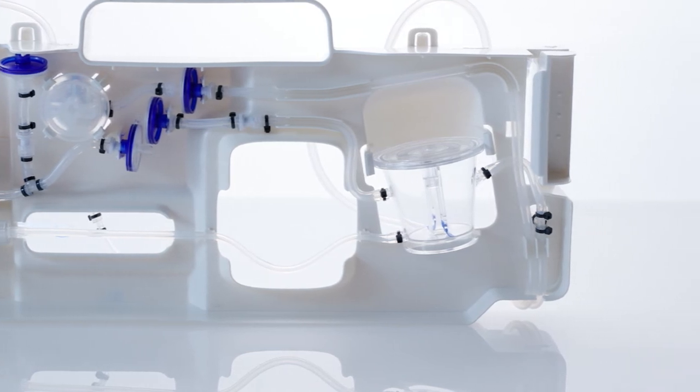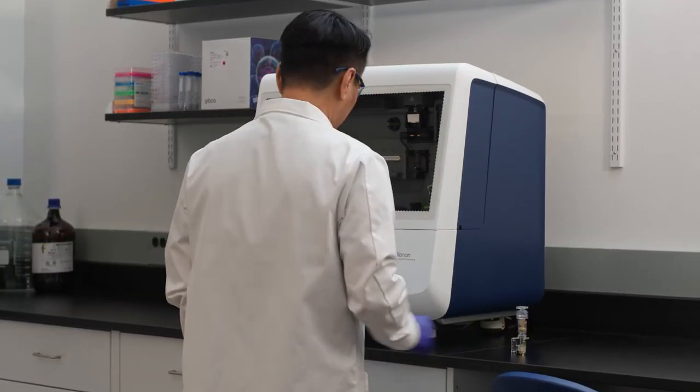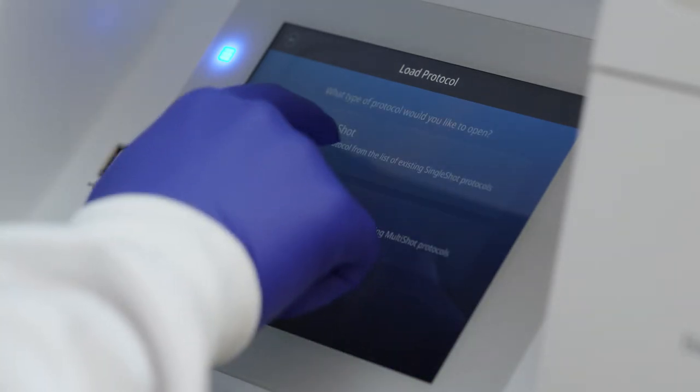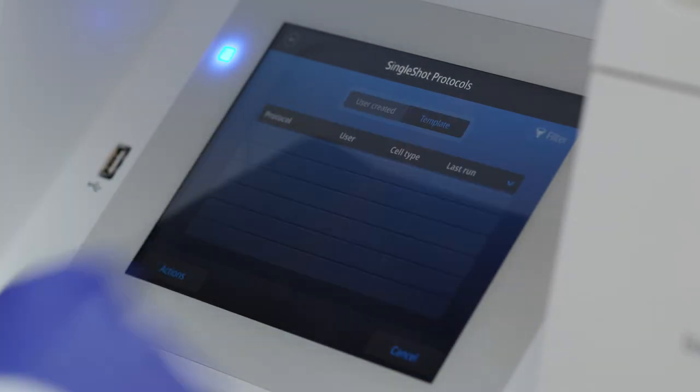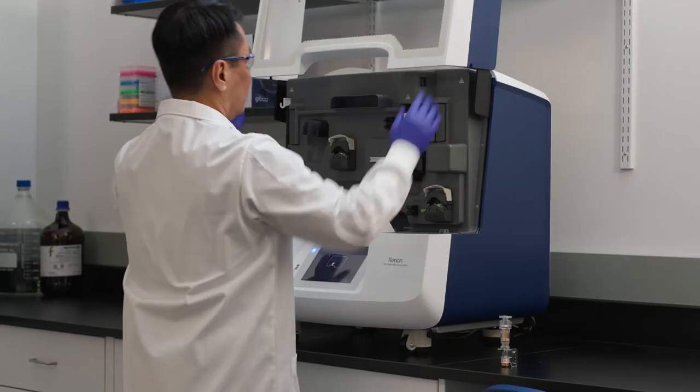Processing occurs one milliliter at a time. The system includes proprietary buffers that are compatible with a variety of cell types and optimized for the instrument's hardware. The user-programmable system enables you to create and optimize electroporation protocols.